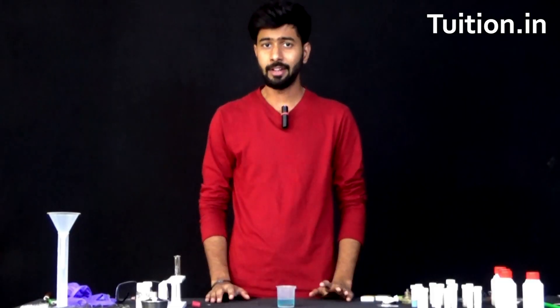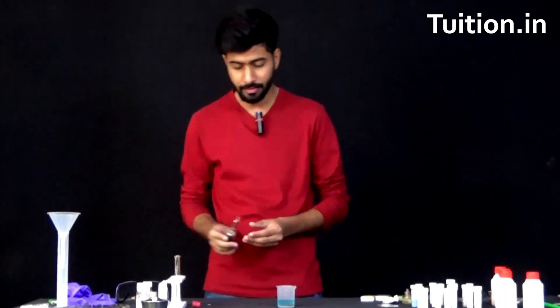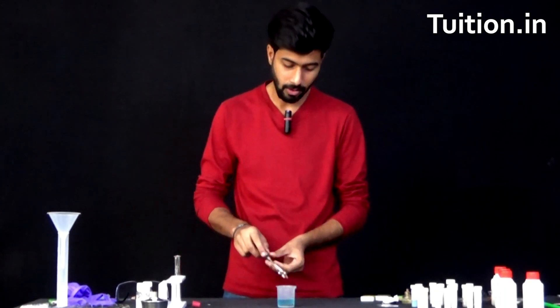After waiting for half an hour, it's now time to look at how the iron nail that we put inside the solution looks like. Let us remove the iron nail with the help of these tongs.